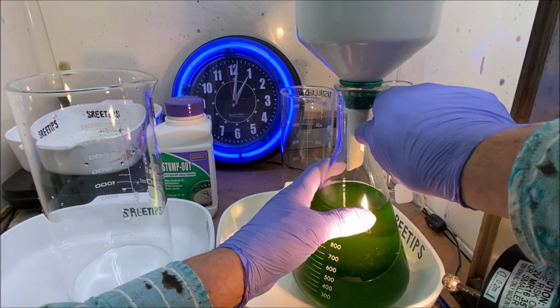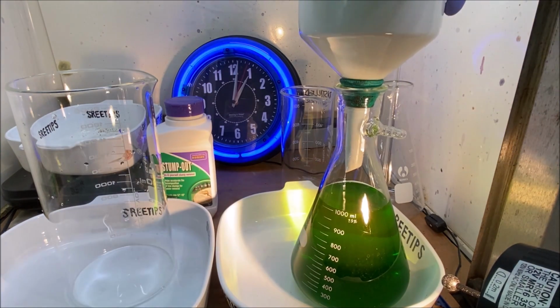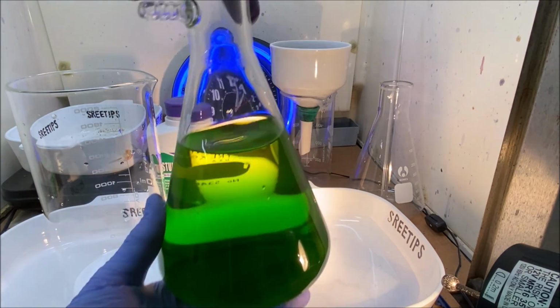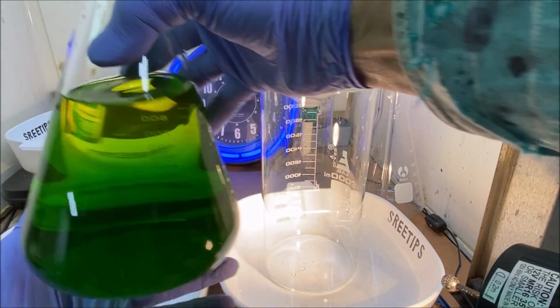Okay, here's what comes next. Get rid of that. Get rid of our funnel. Here's our solution. Should be free of sediment. We're going to pour it in this beaker.